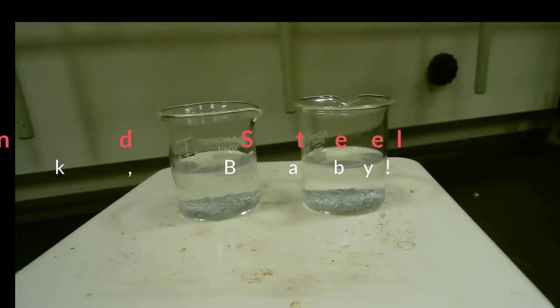Here we have two beakers of zinc granules coating the bottom, and we've added 25 milliliters of our 3 molar NaOH. We're heating to boiling on this hot plate, at which point we will drop in our copper samples.